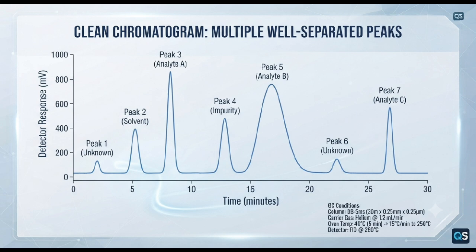Typical chromatogram. A good residual solvent chromatogram should show well-defined and adequately separated peaks. The retention time should be consistent and critical solvent peaks should meet the required resolution criteria. Unexpected peaks, poor peak shape, inadequate resolution, or abnormal response should be investigated according to laboratory procedures.